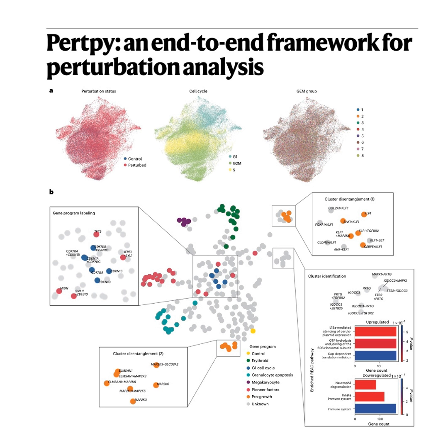Incredible. And that leads us to the final case study, which has direct clinical relevance in triple-negative breast cancer, or TNBC. Right. Here they were looking at patient response to chemotherapy, with or without a new immunotherapy. The focus was on the tumor microenvironment. Tracking immune cell shifts. Yes. Using scCODA, Pertpy looked for changes in the composition of immune cells, like CD4 and CD8 T cells, before and after treatment. And they found significant shifts only in patients who got chemotherapy alone. But not in the combo therapy group. Not in the combo group. It suggests the combination therapy might be modulating the T cell environment in a fundamentally different, maybe less drastic way, which could have implications for prognosis.